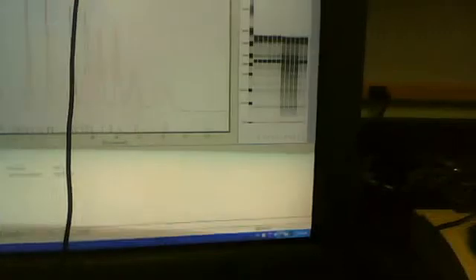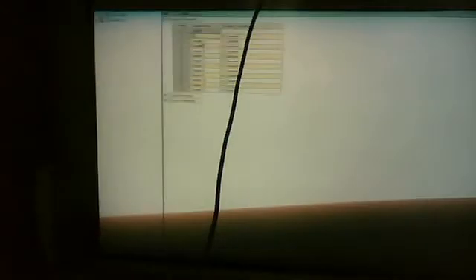Once you get your unit started, you just hit play. It'll hit new run. It says no instrument available, but we're pulling one up. Just go to file, hit new run, and then you'll see this will pop up. I don't know if you can see that real well, but we're going to try to get it. You want to label all of your sample names into here. Each unit will let you label whatever you name it. This is done. It'll beep at you. Then you place it into here. You close the unit, and it's ready to go. So just push start.